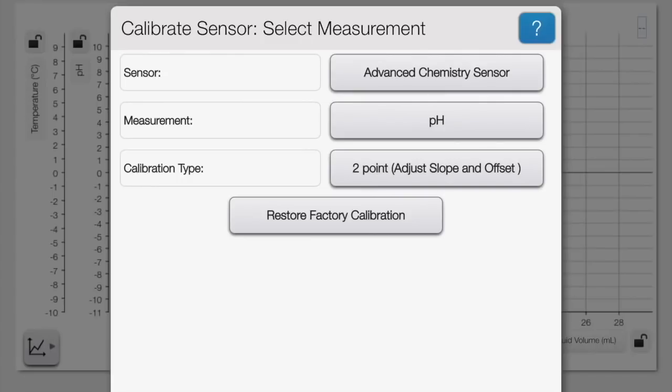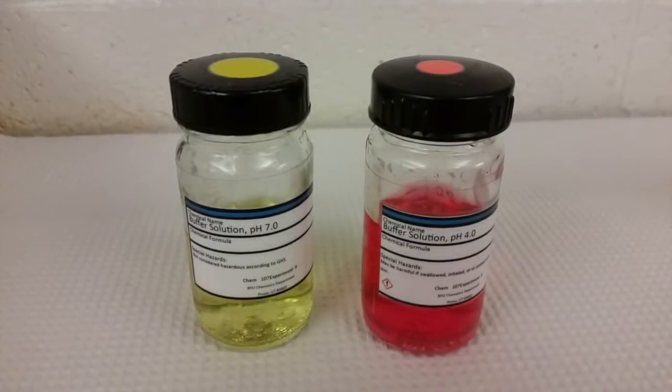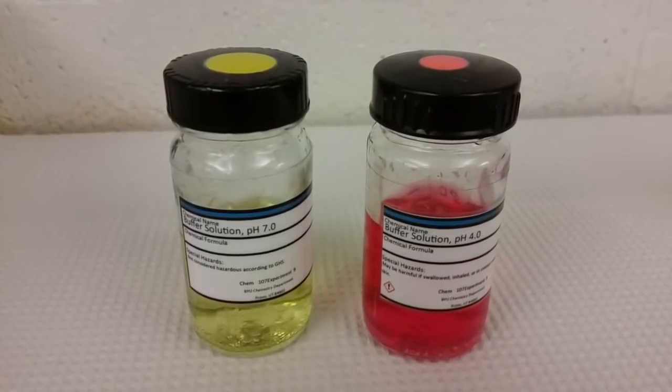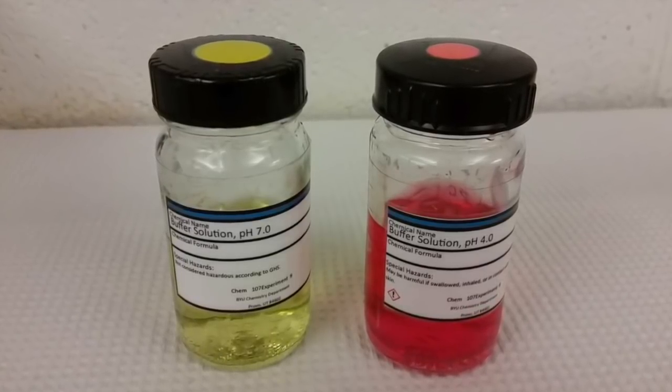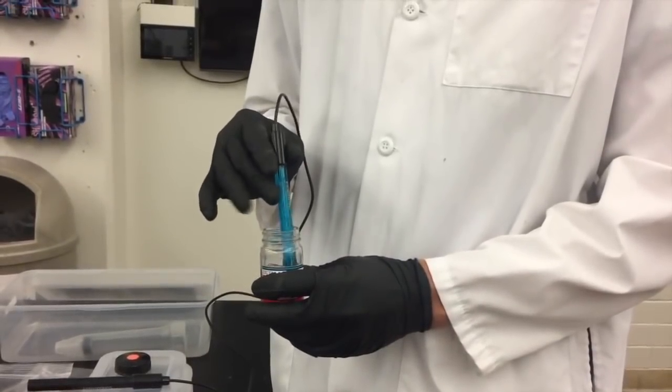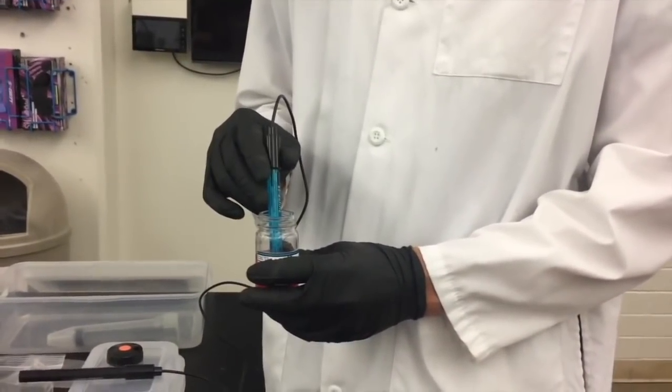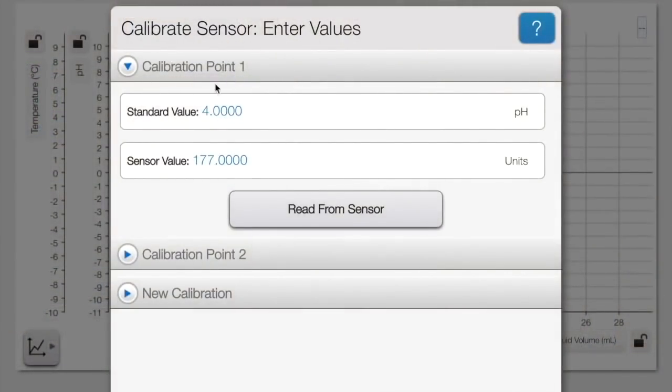You'll need to rinse the pH meter first with distilled water. Then you'll need to find the pH 4 buffer solution. There are only two sets of buffer solutions per lab room so be patient as they're passed around between the lab groups. Once you have the pH 4 buffer solution put the pH meter in the solution and stir it around for at least 30 seconds. Then click read from the sensor where it says pH 4.000.